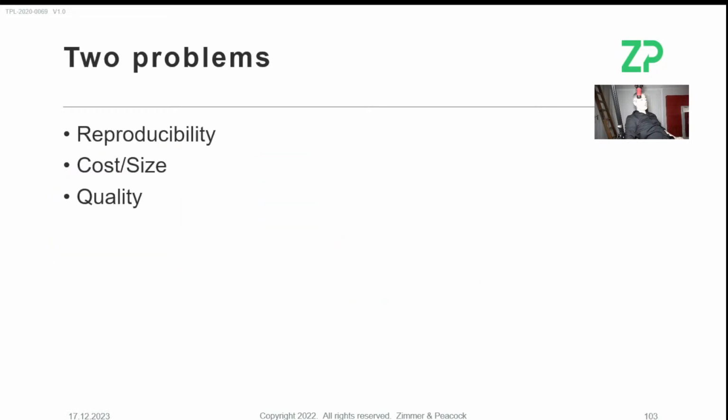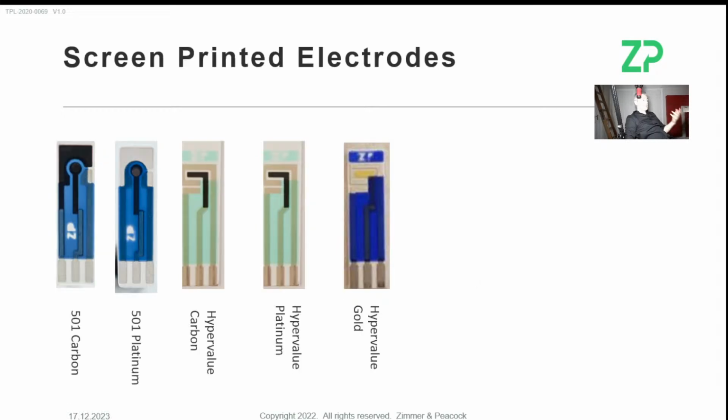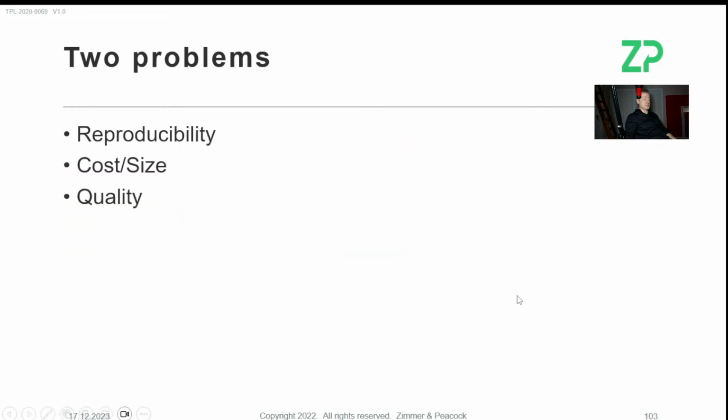I also talk about the fact that whenever you go for custom electrodes, honestly, you'll always be disappointed on the quality. Manufacturing is not just something that comes. We've really built up our manufacturing to make these electrodes really reproducible. So your biggest disappointment will actually be reproducibility. I say 2 problems, I should have said 3. Reproducibility is going to be the biggest issue. You will find people who will do it for you. You can send a sketch to ZP, ZP can do it for you.